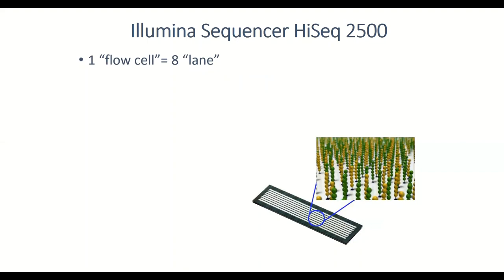What happened is within a tube, the company already pre-manufactured the barcode and lots of different stuff. And what we have to do, I'm talking about the sequencing lab, is inject the sample into the lane. Okay, so which means we can put different samples into different lanes. A couple of years ago, each lane could sequence just one sample.